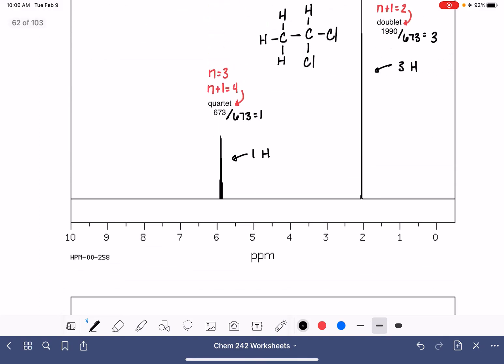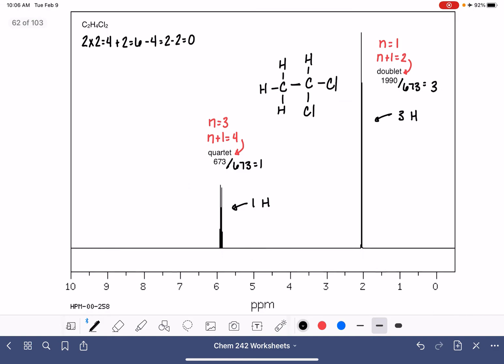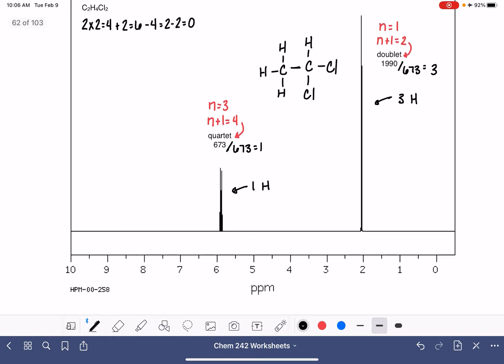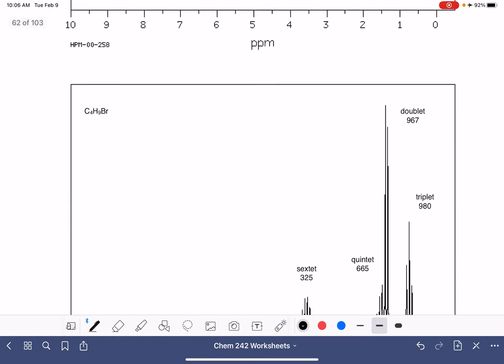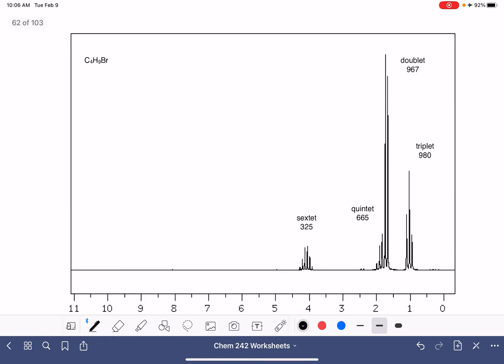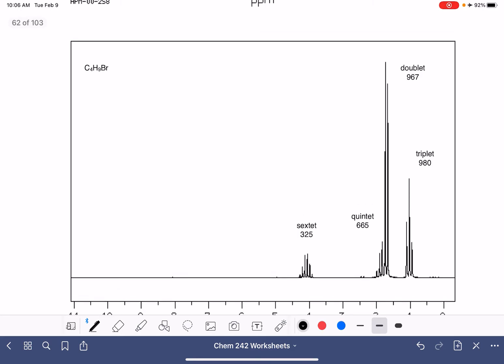Notice that we haven't had to pay any attention to chemical shift at all to figure this stuff out — it hasn't been necessary yet. It's not always going to be unnecessary, but in this case it is. For our next molecule, C₄H₉Br: 4 times 2 is 8, plus 2 is 10, minus the 9 hydrogens and the 1 bromine, giving another HDI of 0.